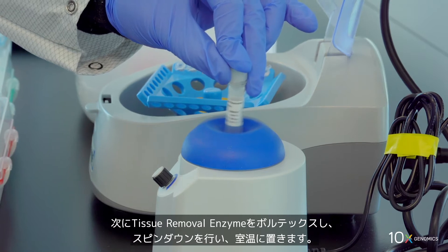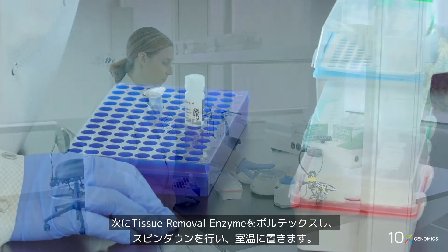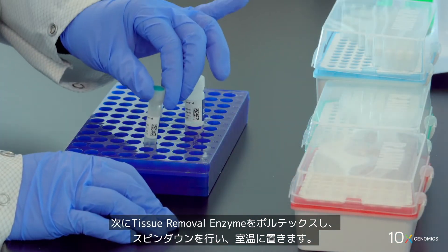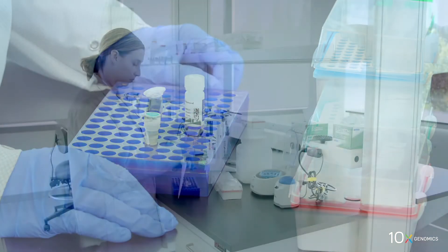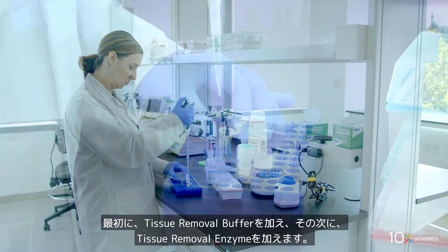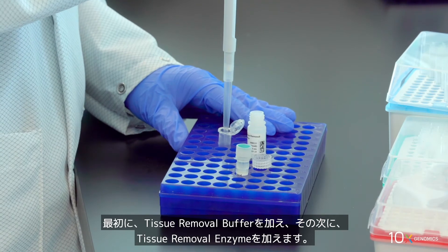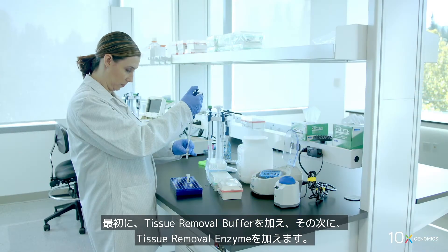Next, re-vortex the tissue removal enzyme, spin down briefly, and store at ambient temperature. Add the reagents in the order listed in the user guide. First, add tissue removal buffer, then add tissue removal enzyme.